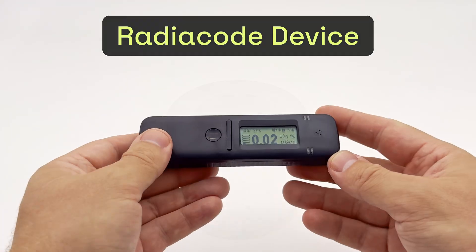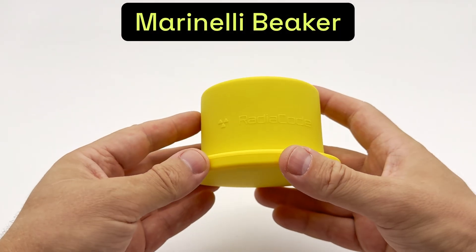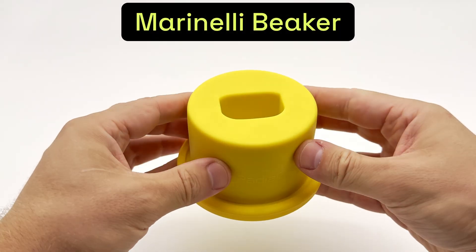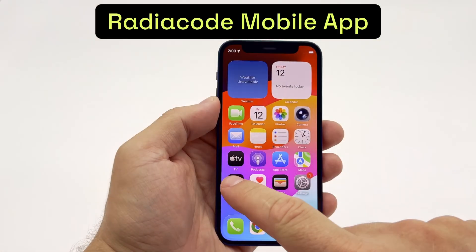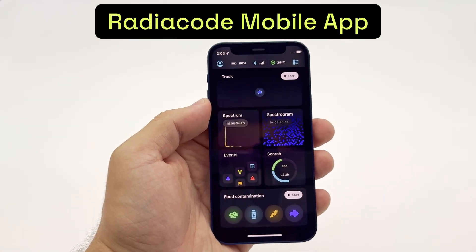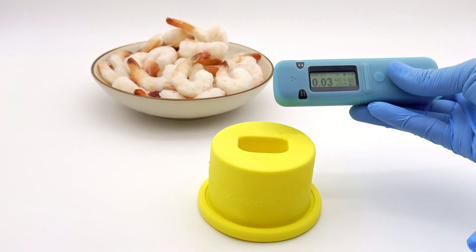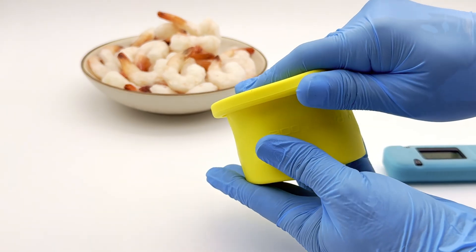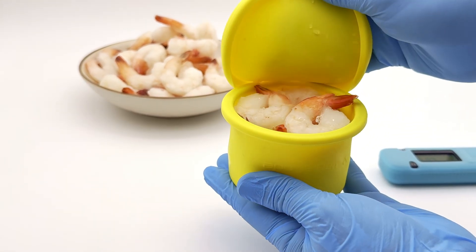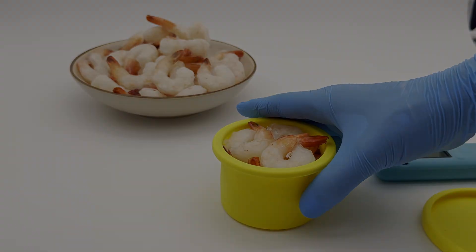What you will need: a Radiocode radiation detector, a Marinelli beaker that allows the sample to surround the sensor on all sides, kitchen scales, and the Radiocode mobile app for iOS or Android. This setup will help us to estimate the concentration of cesium-137 in food and compare the result with the maximum permissible concentrations for that type of product.